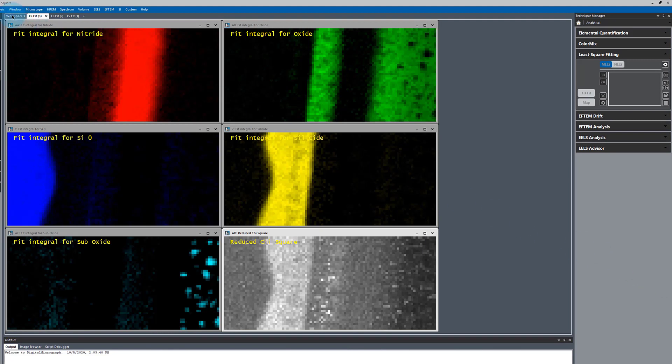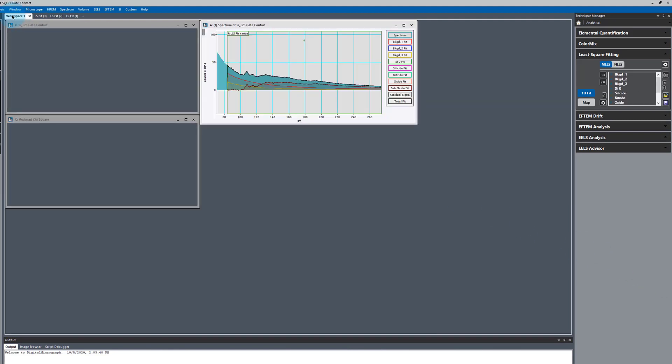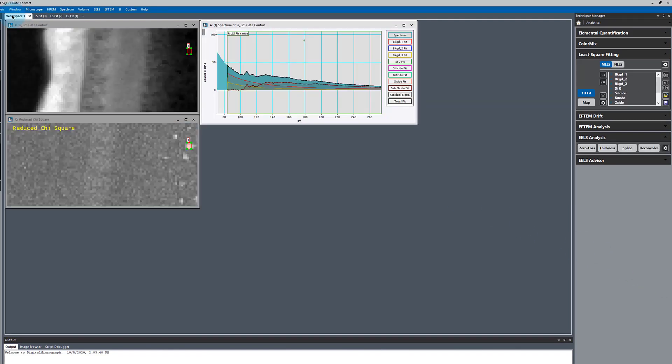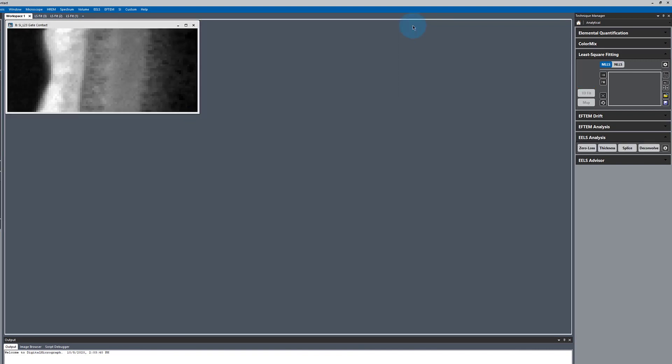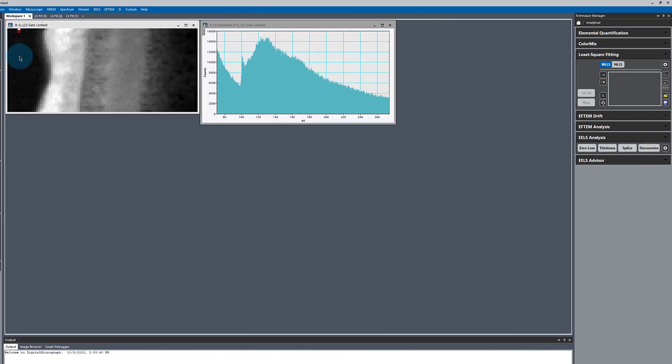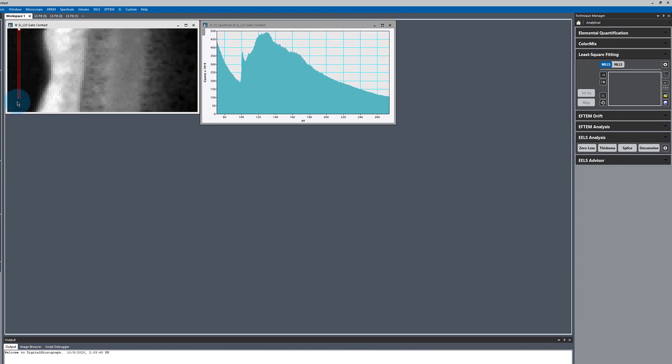Let's explore a couple other options. I'm going to go back to my data and get rid of this chi-squared. So I'm holding down the Alt key when I click the X.